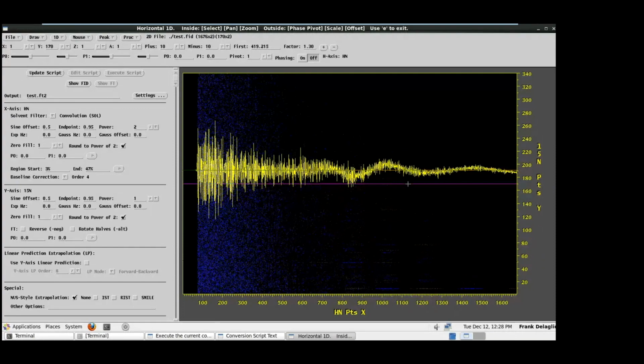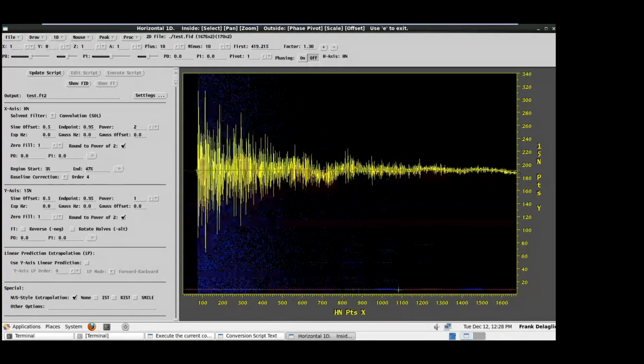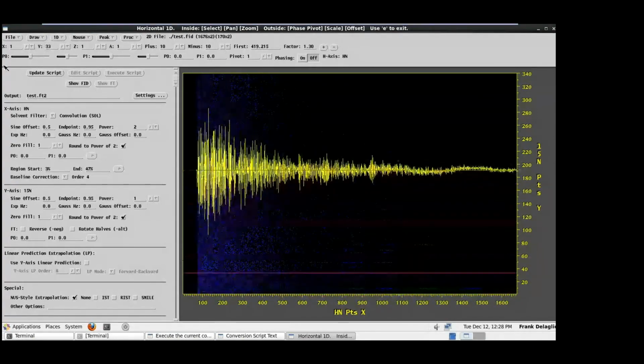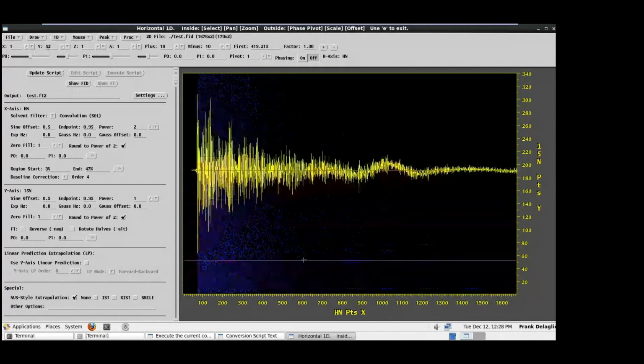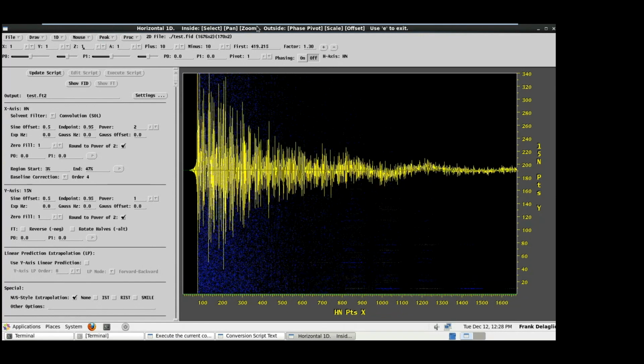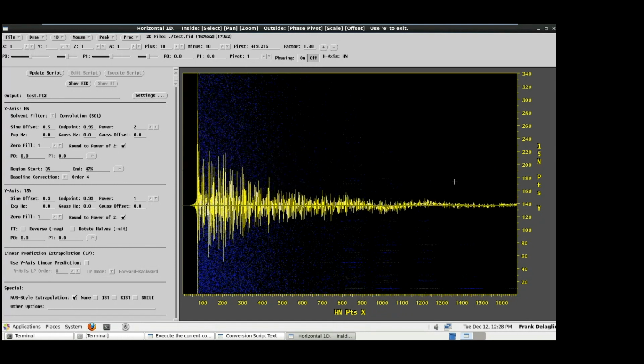And so I can use the mouse to scan through the data and look for a particular 1D slice. And you might notice in the command panel, as I drag with the mouse to look at different slices, the particular slice number changes in the command panel. And if I want to, I can type a particular number, like 1, to look at the first 1D slice in the data. So here is the first 1D slice from this two-dimensional experiment.